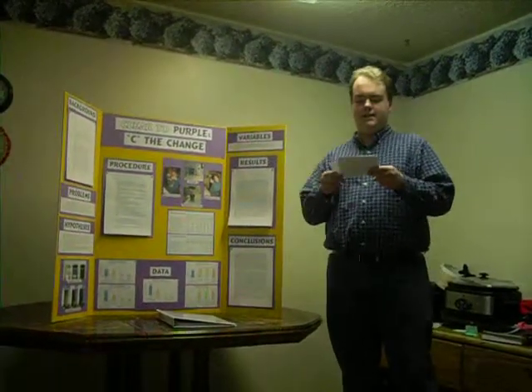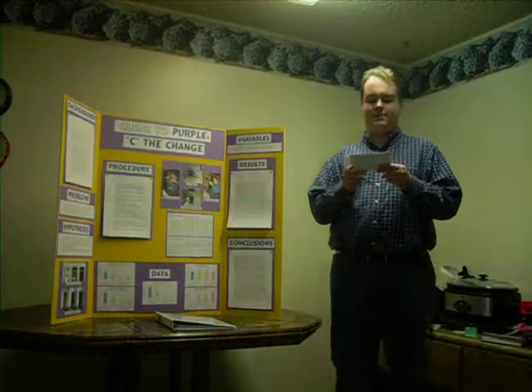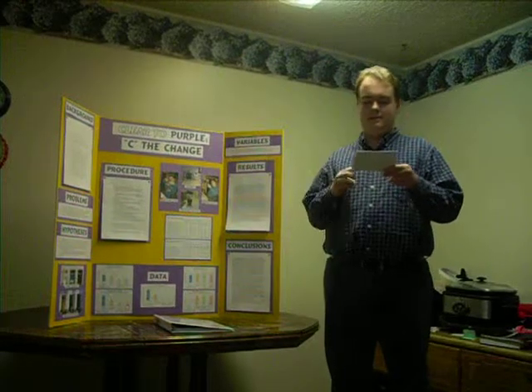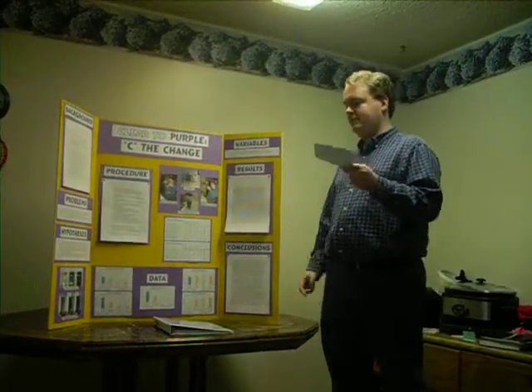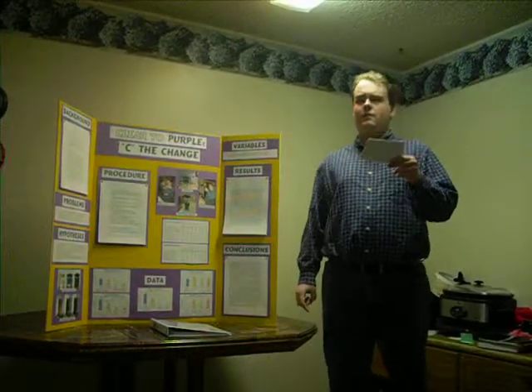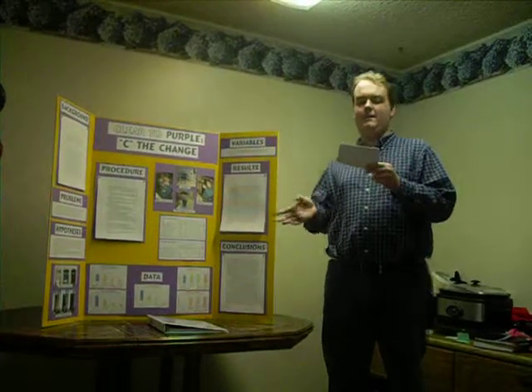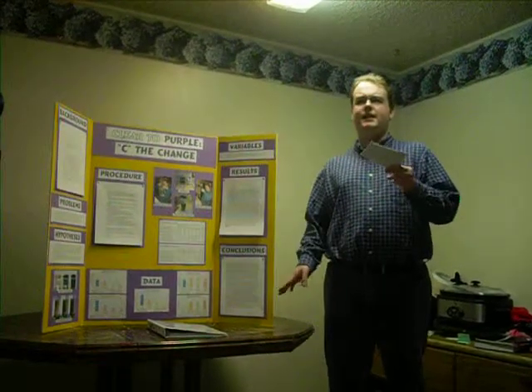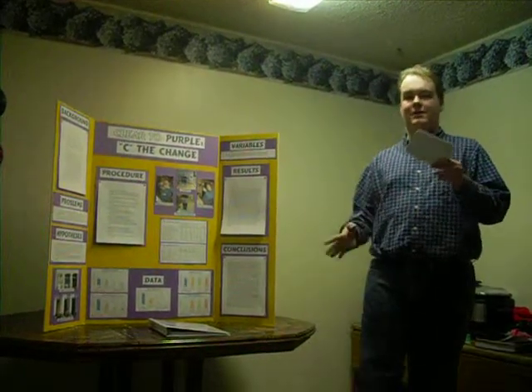To test these, I designed several procedures. For the vitamin C experiment, I designed a base experiment and varied off of it. Here's the base experiment, and then I'll tell my variations afterward. I made a vitamin C stock, which was 9 500 milligram vitamin C tablets in 270 milliliters of water. This I used for more than one repetition because it would be way too much.